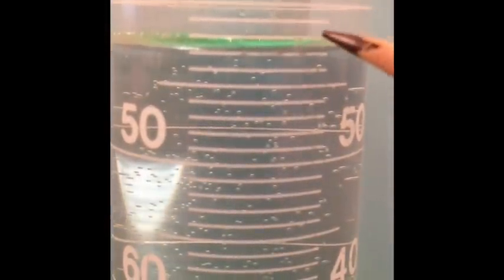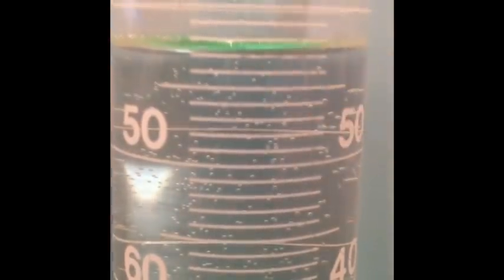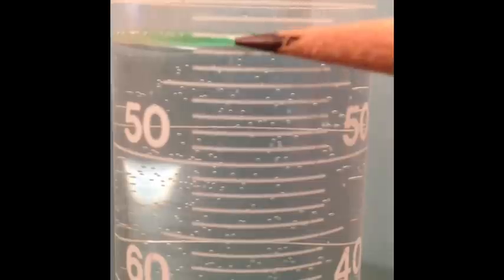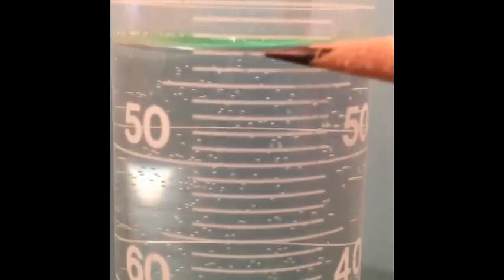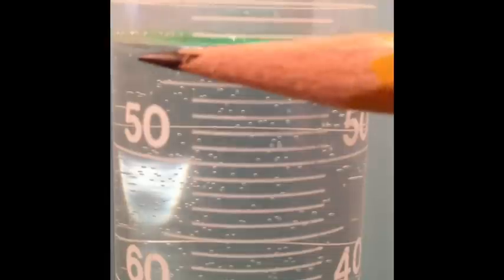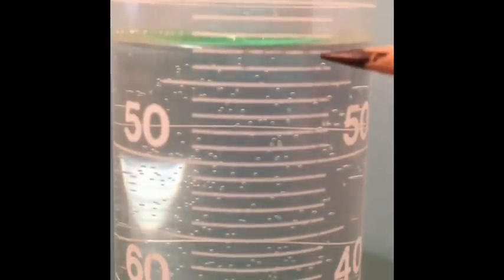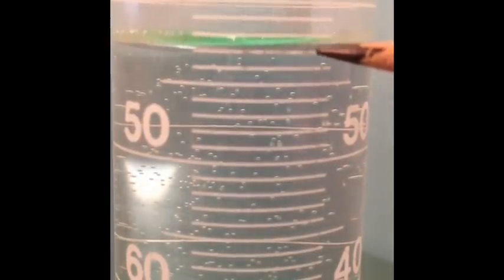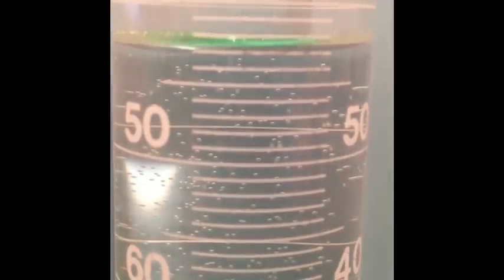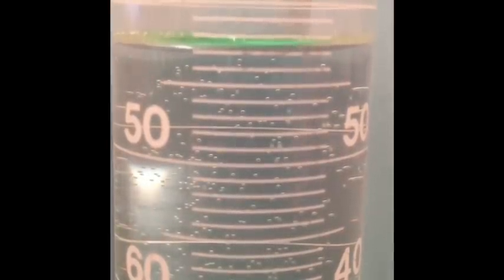So it's very, very important that you don't go up to the top of the water. You have to go to the bottom of that curve. You have to get your eyes all the way down there, and it's almost like you're looking through the bottom of the top. Very kind of weird, but it's the bottom of the curve. So this would be 57 milliliters of water. And remember, we're measuring volume, the amount of space the object takes up. The key is you have to look at the bottom of that meniscus. So this one has 57 milliliters of water.